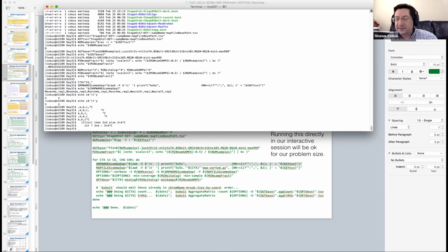It's just the compact form expression for that. If we're on the first line, nothing, otherwise a comma. And that does exactly what we need, right? On the first line, because that goes before the sample name, we don't do anything. Then we do sample name. Second line, we do a comma, sample name, and so on. Last line, comma, sample name, and no comma at the end. So that's how you get the commas just in between and not at the front and back, right?